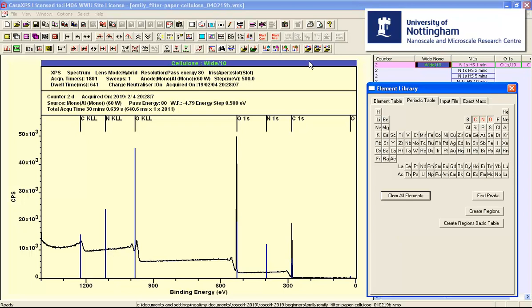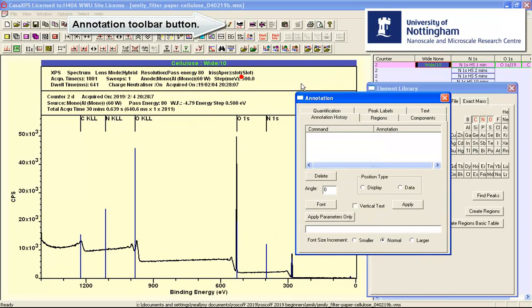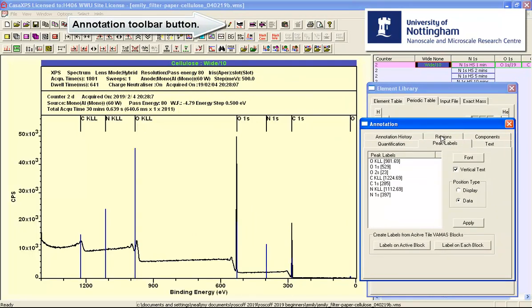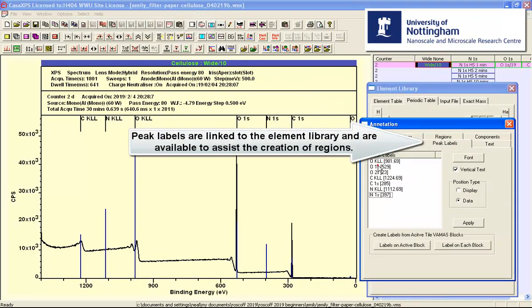And since it's only found two elements, if I were to try and create regions from the element library, it will only create regions for these two elements that were found. So what I need to do now is find a way of forcing the creation of regions. And I'll do this by adding labels to these data.